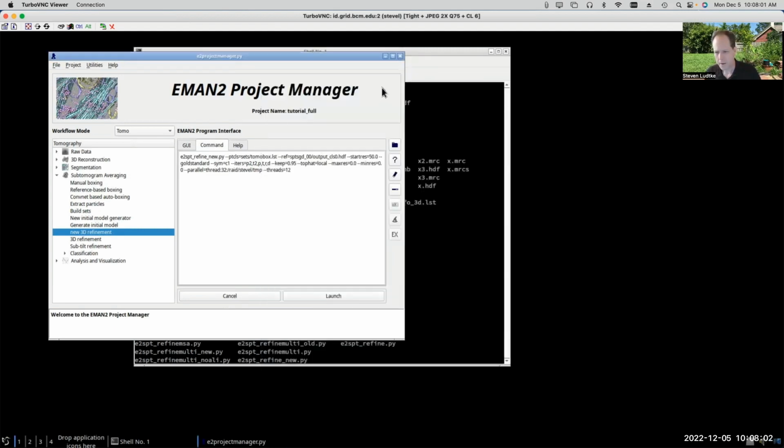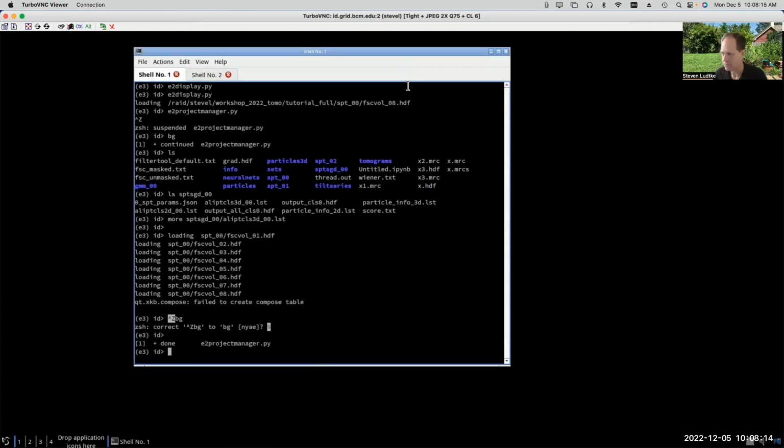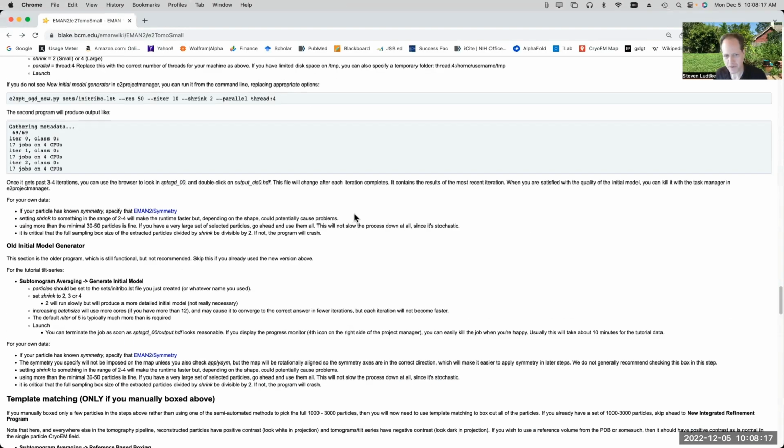All right. So the Gaussian mixture model stuff. So I've been mentioning that we didn't have a tutorial for the new graphical interface version of this. We now kind of do. So I've written a tutorial now.